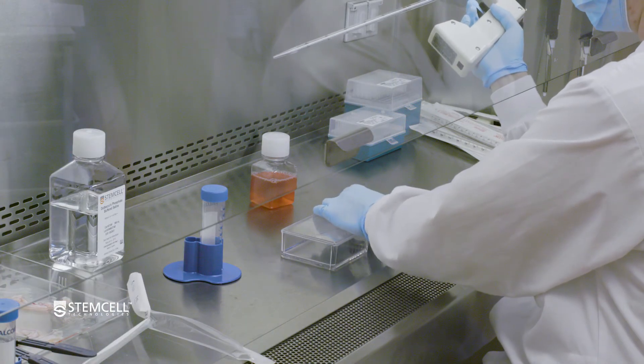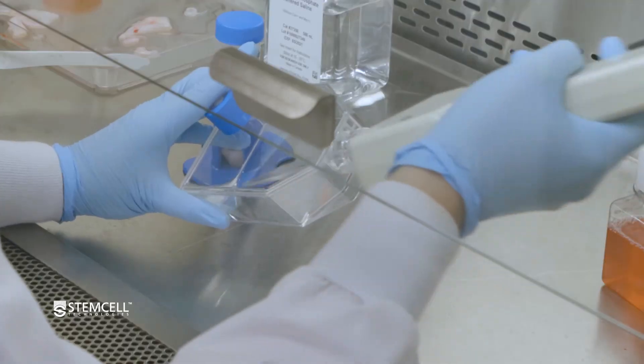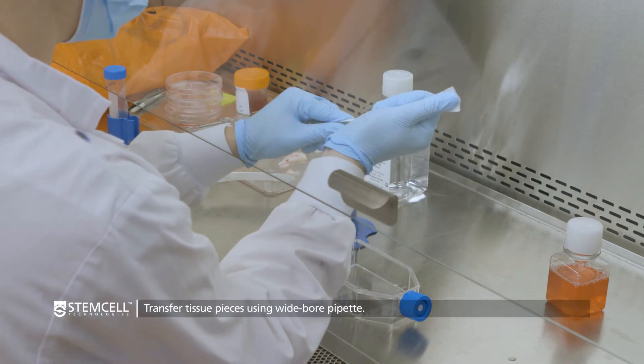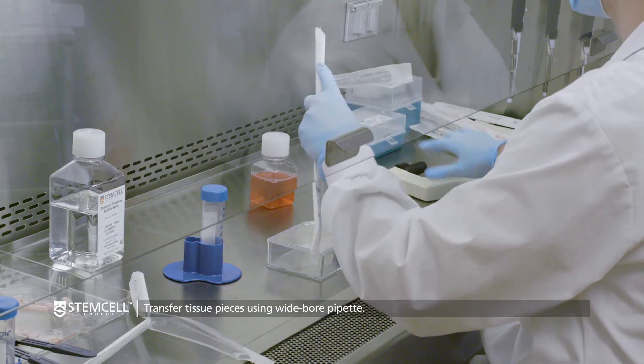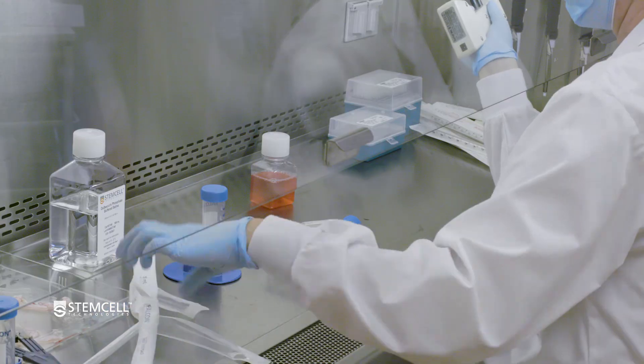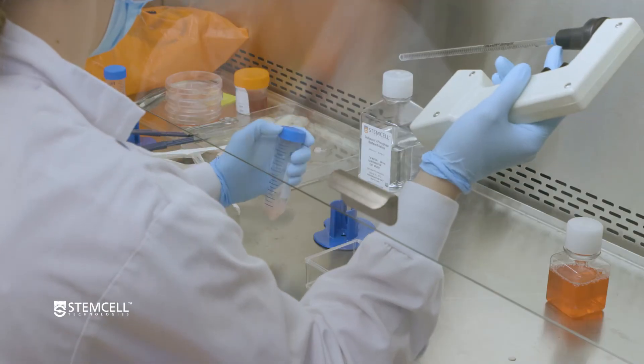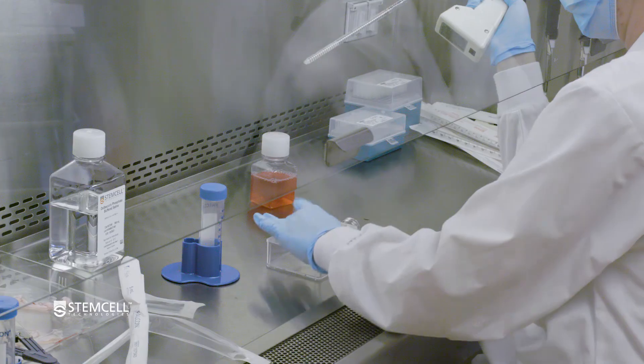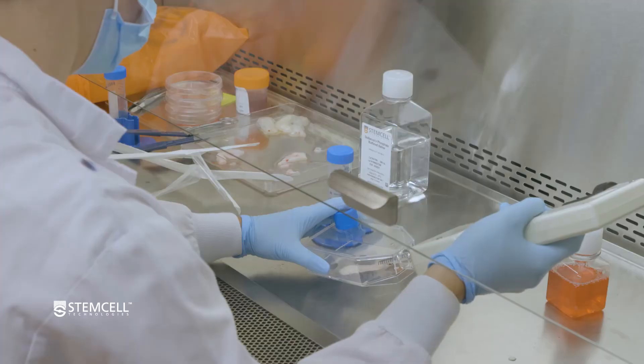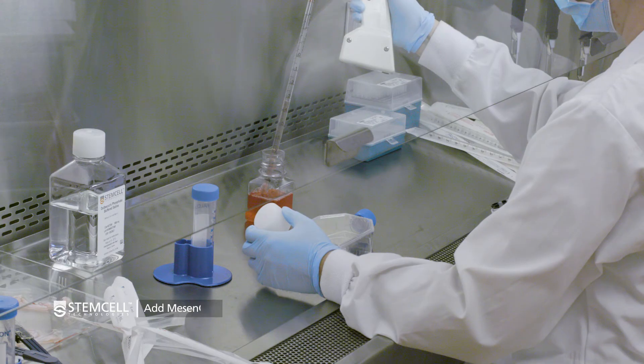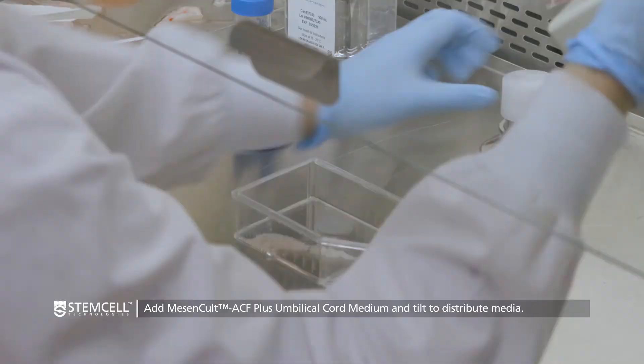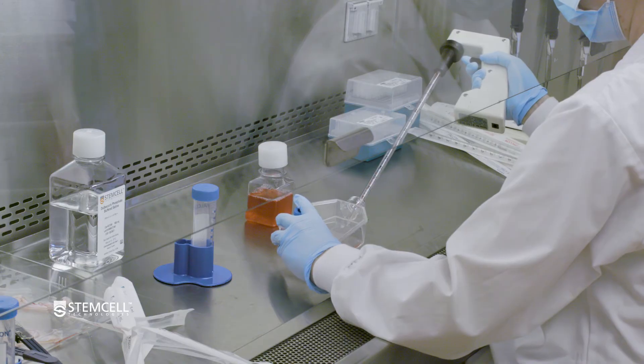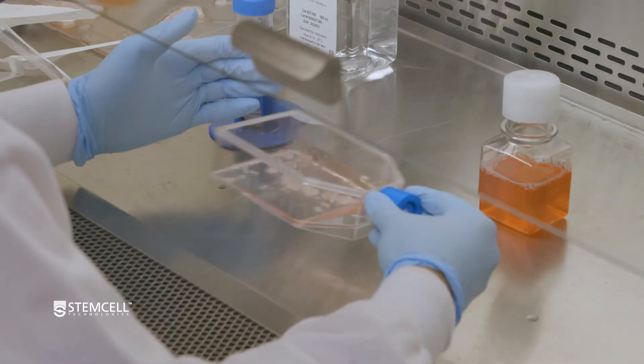Before plating the tissue pieces, remove PBS from cultureware. Divide and transfer tissue pieces into pre-coated cultureware using a wide-bore pipette. If you don't have a wide-bore serological pipette, break the end of a 5 ml serological pipette under sterile conditions. Slowly add 8 ml of complete MesenCult ACF Plus umbilical cord medium to each flask. Tilt to distribute the media and tissue pieces evenly around the flask.